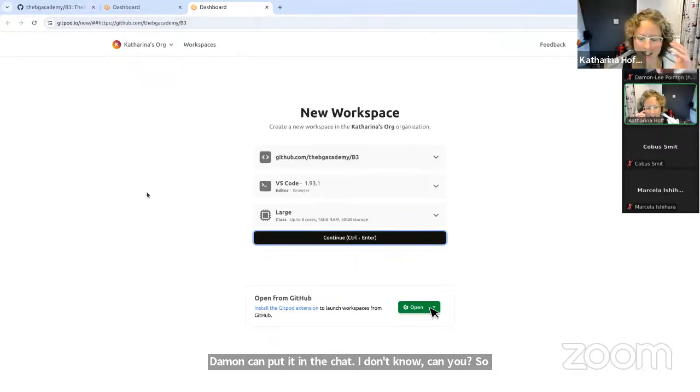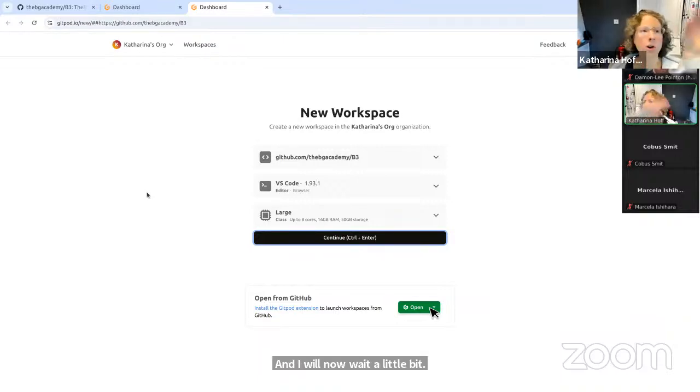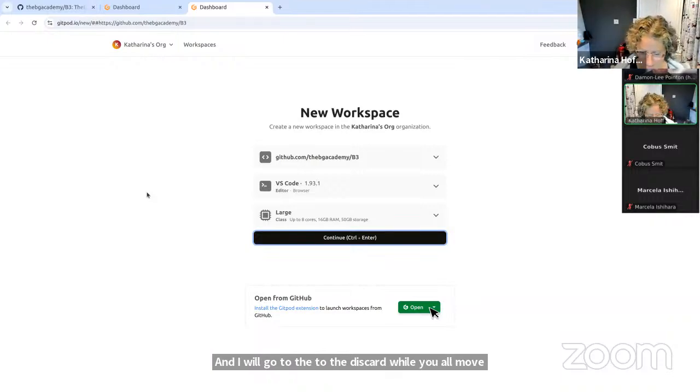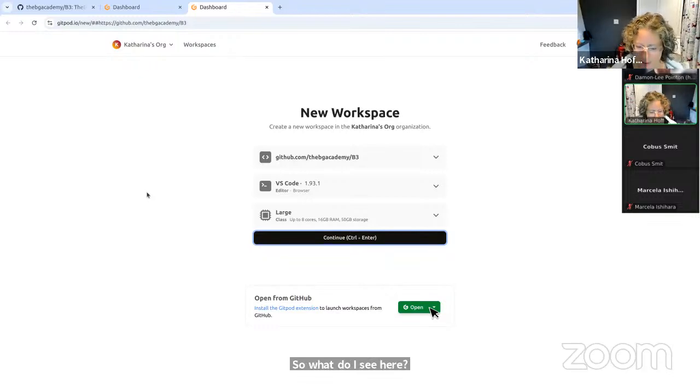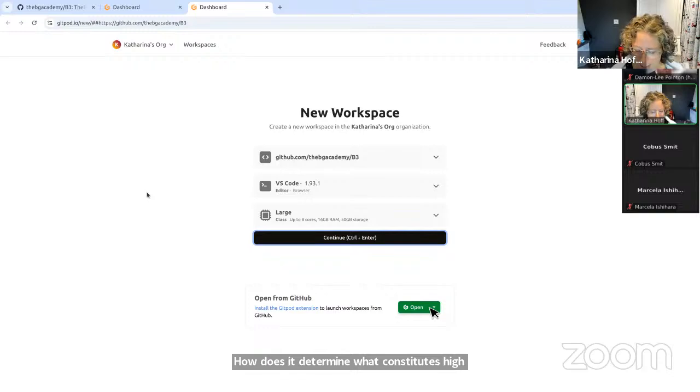And I will now wait a little bit, and I will go to the Discord channel while you all move on to the Gitpod, okay? And I will answer questions. So what do I see here? There was a question: is there a minimum number of gene models that Augustus requires for training and prediction? How does it determine what constitutes high-quality gene models as the training GTF file?